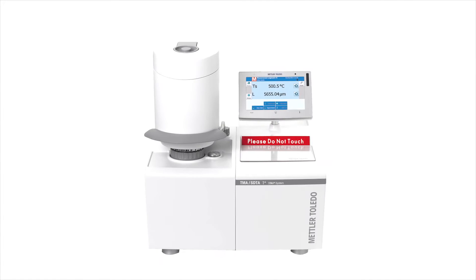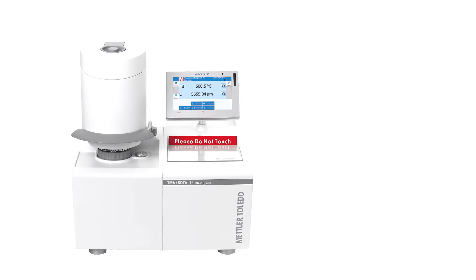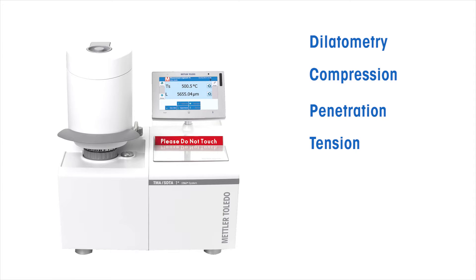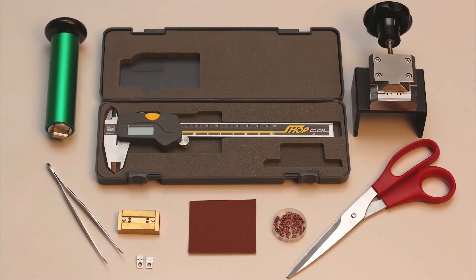The Mettler Toledo TMA SDTA supports the following measurement modes: dilatometry, compression, penetration, tension, three-point bending, swelling, and volume expansion. Different measuring modes allow you to perform measurements on solid samples, foams, films, and fibers.